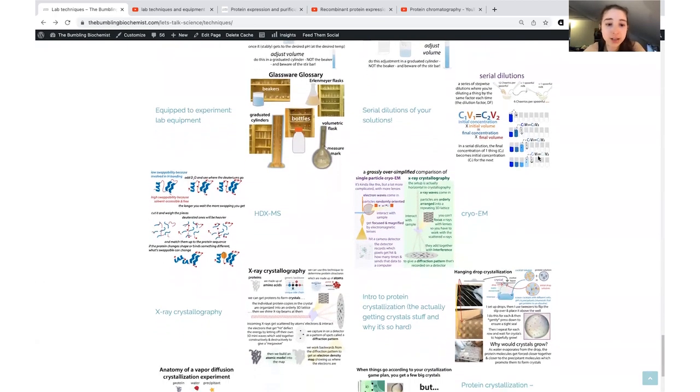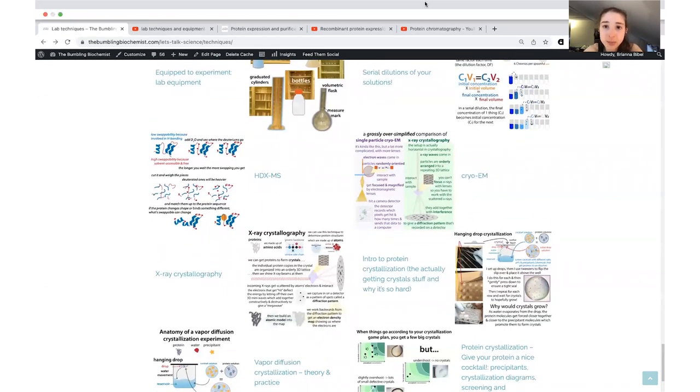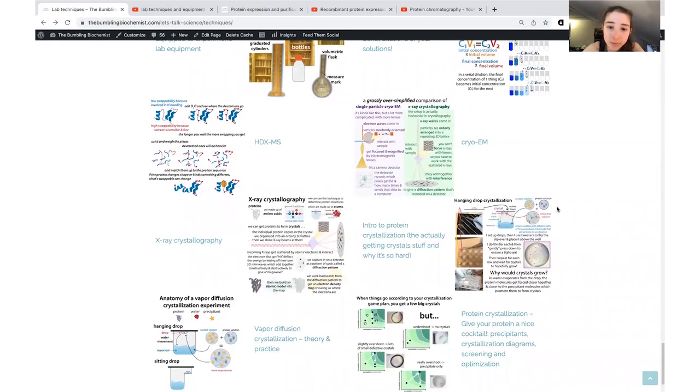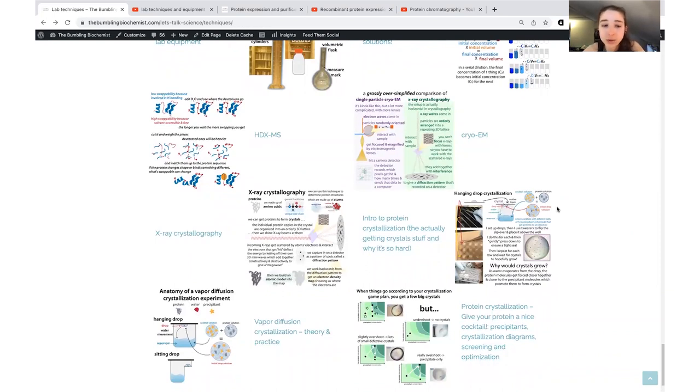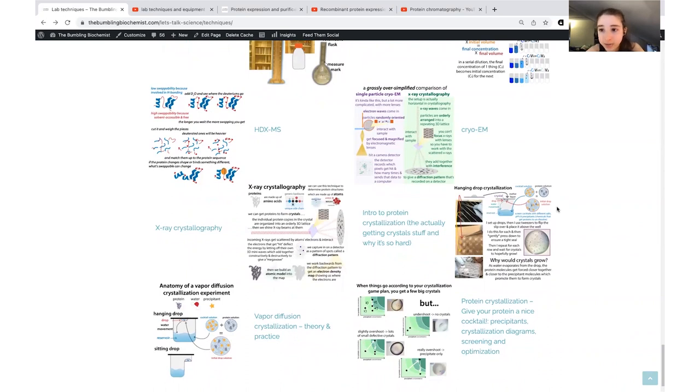Finally, on this page, we're talking about some structural biology techniques. With structural biology, we're looking at the shape of molecules and their form, and how that form relates to their function. I like to give the analogy of a Swiss Army knife, where if you know what the various parts of the Swiss Army knife look like, you can predict what various parts would do. And then using site-directed mutagenesis, as we talked about, you can make changes to those regions and see if you see the expected changes.